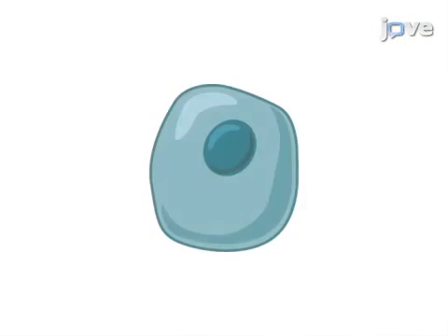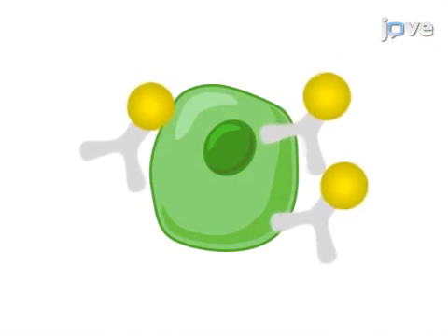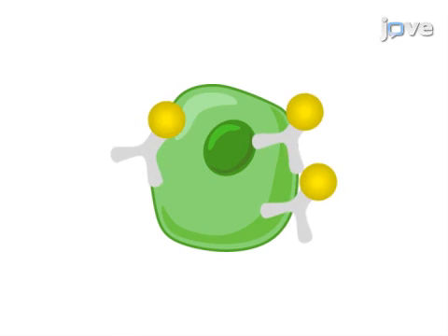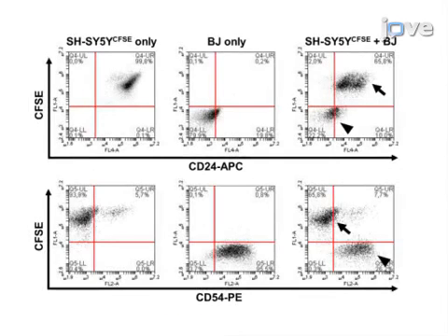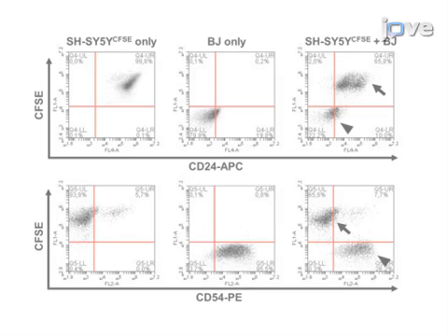Next, an optional non-specific intracellular stain is applied to the cells. Then, the desired surface antigens are immediately labeled with a primary antibody, whereas the desired intracellular antigens are labeled after cellular fixation and permeabilization. Ultimately, results can be obtained by using flow cytometric analysis for co-expression of the surface antigens on specific neural subpopulations of interest, as defined by intracellular label.